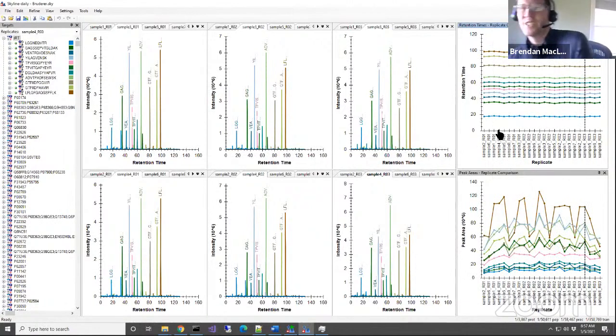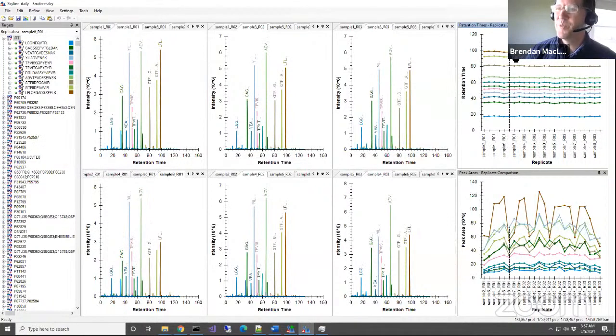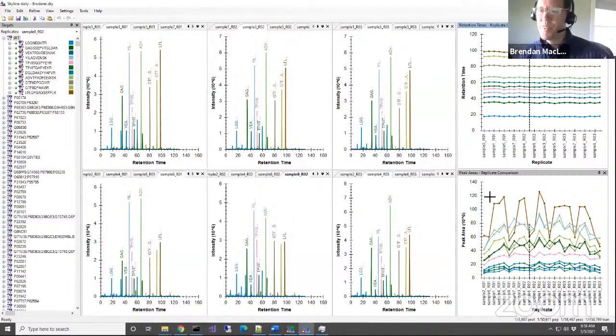So this is hugely helpful. All of these graphs are clickable. Yesterday I was telling you about the Google Maps analogy. I think that's where the Google Maps analogy is the most interesting. I call it directed investigation. If I gave you all this information in a set of PDFs, it would take you so long to get through some of the things that you can get through when you can just go, I'm kind of interested in what happened here, and click on it.